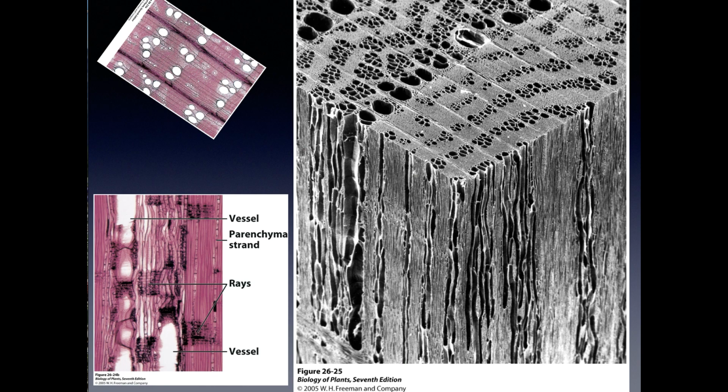And we can see a few things. First of all, we're now seeing a longitudinal version of these vessels. And then there's another one. We're essentially literally seeing the side view of one of these, and this would be that top view like that. And then this would be that side view of that same vessel element like that, okay?